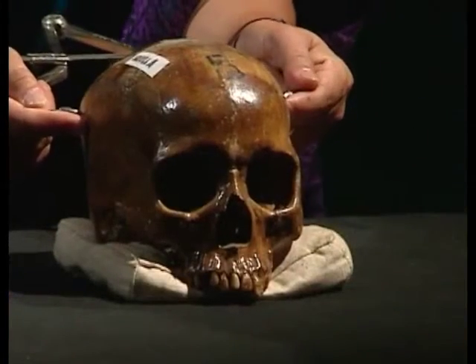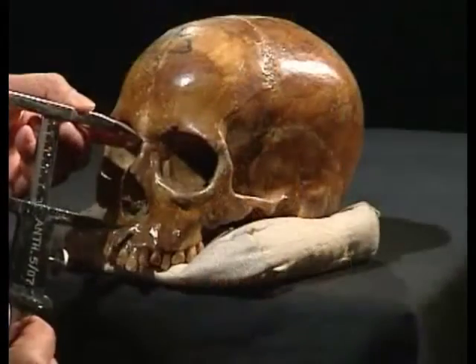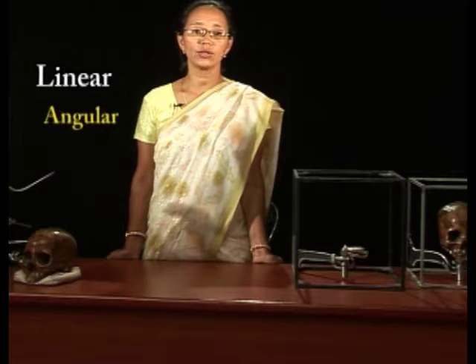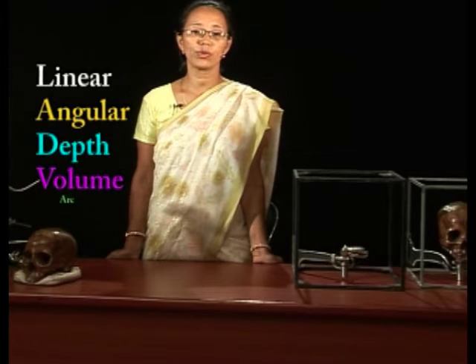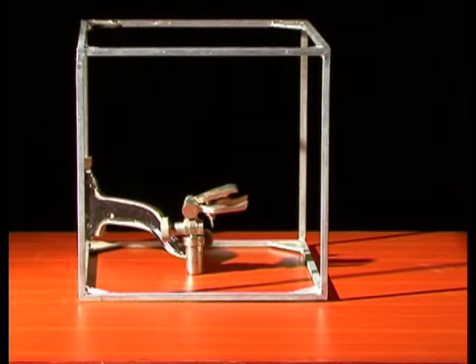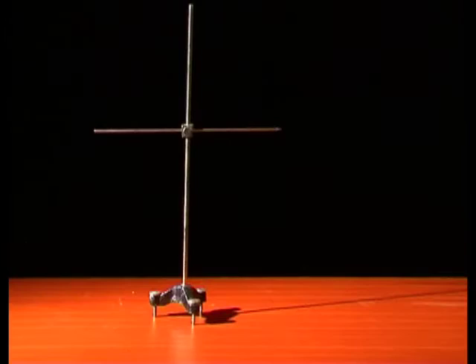This particular aspect is dealt under craniometry, one of the divisions of anthropometry. Craniometry is concerned with the technique of measurements of the skull and the face of the skeleton. It includes measurements of different types such as linear, angular, depth, volume, arc, etc. And hence, different types of instruments are needed to take different types of measurements.